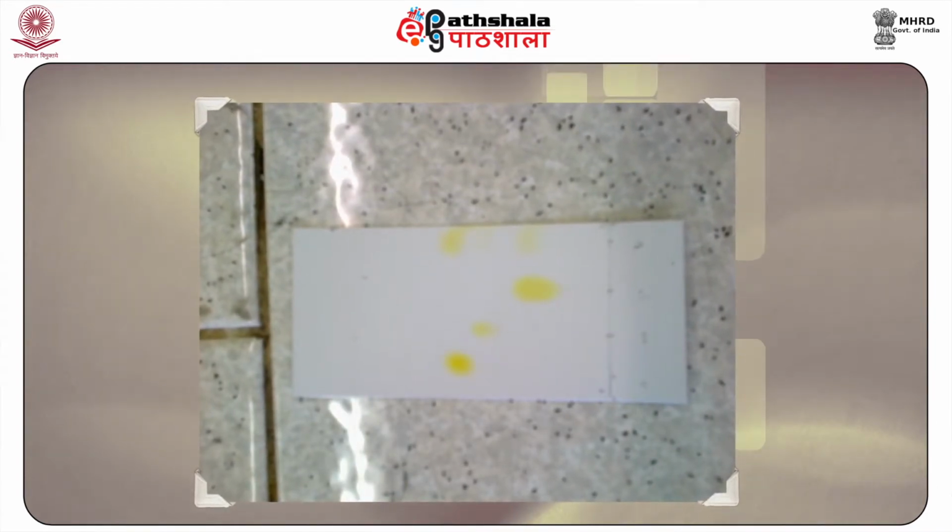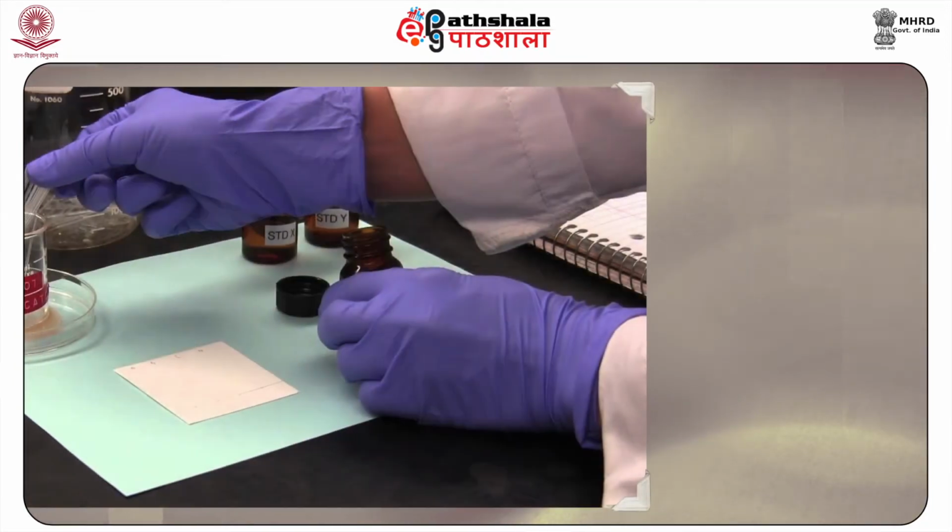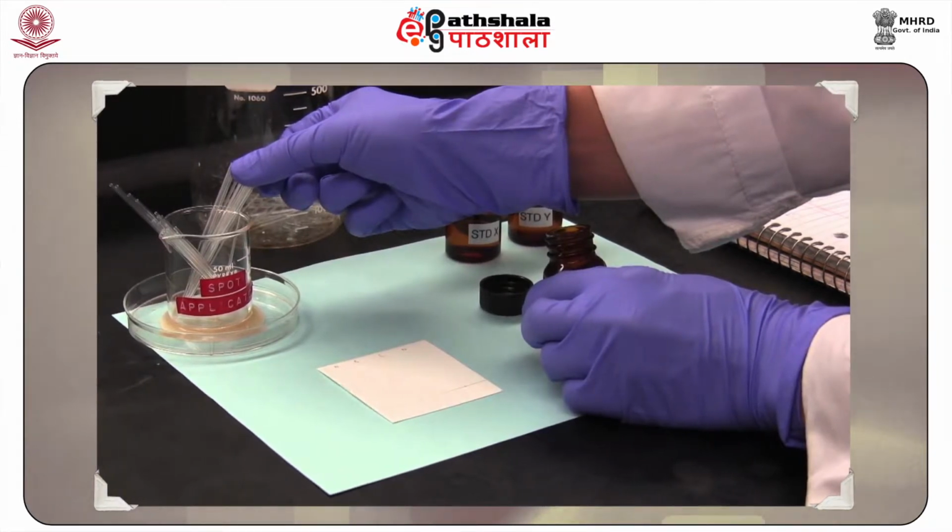Thin layer chromatography, or TLC, is a chromatographic technique that is employed in separating a mixture of non-volatile substances. TLC is performed on a sheet of plastic, aluminium foil, glass, etc., which is coated with a thin layer of adsorbent material, generally cellulose, aluminium oxide, or silica gel. This adsorbent layer functions as the stationary phase. After applying the sample on the plate, the mobile phase, made up of one or more solvents, is drawn up the plate through capillary action. As different analytes have their own characteristic speed of migration, they get separated on this basis.